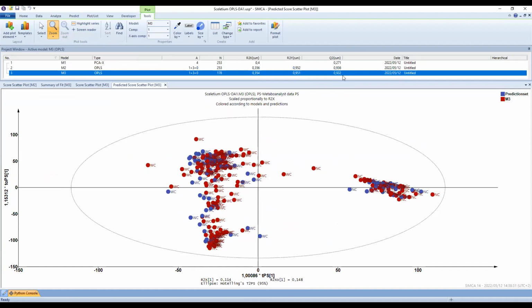Even with a high predictive ability, it's important to use an external data set where we bring in samples from Northern Cape and they have to sit together with the Northern Cape samples. Otherwise, we have modeled data, but our model is not trustworthy. So this is just to test and validate that the model that we've created actually works.